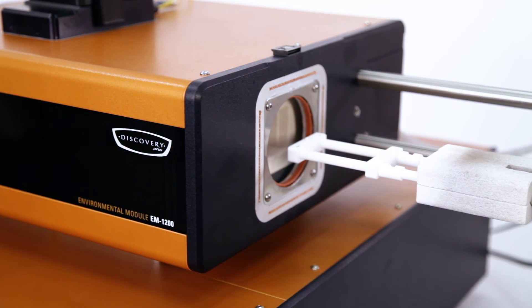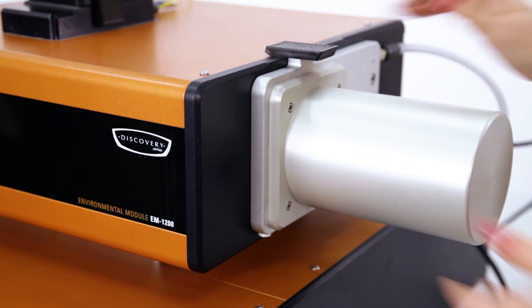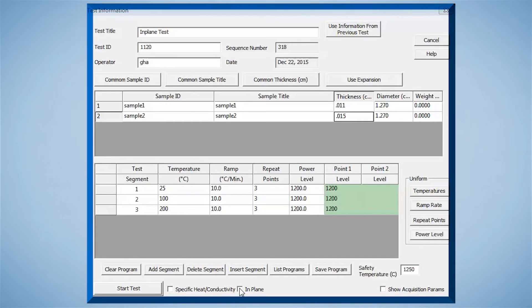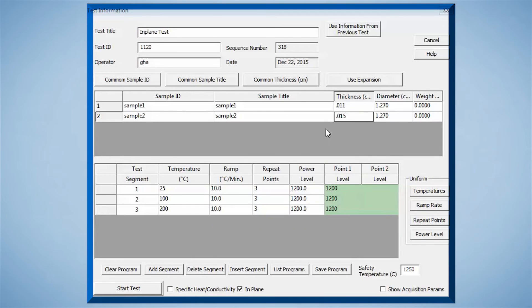After you put the sample in, you're ready to start the test. In the test setup page, after you enter the test information and temperature points, make sure to check the in-plane box to apply the appropriate model to the measurement.